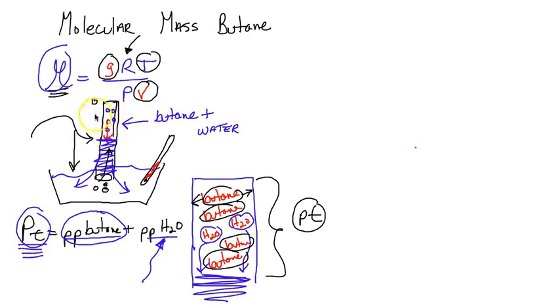All right, so to figure out what the pressure is here, understand that what you're looking at is really a manometer. You have a tube with water being suspended, and you've got atmospheric pressure pushing down. So what you really have is the force over the area of the atmospheric pressure pushing and keeping up the water. So the atmospheric pressure is not only pushing back on this gas, it's pushing up the water. So we can think the atmospheric pressure should be what? Higher than the pressure in here. Now, if you don't see that, let's make a manometer.